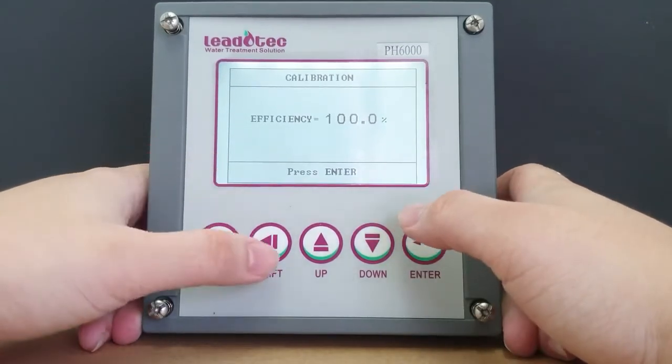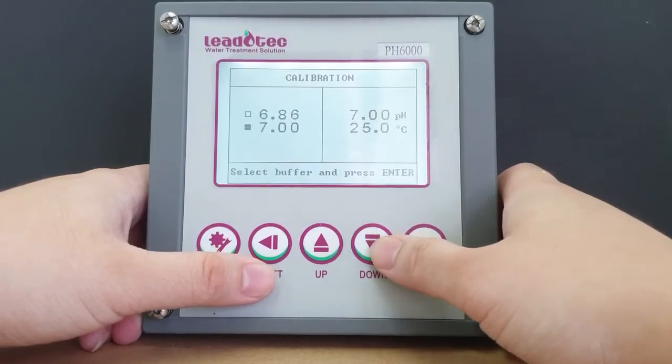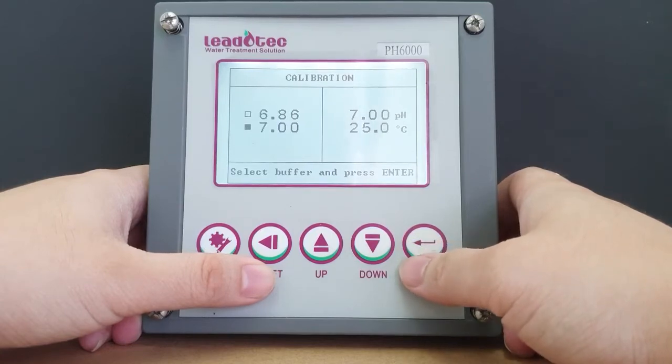On this page, it will show you the calibration efficiency for the previous calibration. To proceed, press enter once and select the first point buffer.